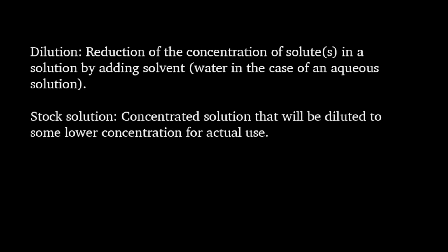Dilution is the reduction of the concentration of solute in a solution by adding solvent. Stock solution is the concentrated solution that will be diluted to some lower concentration for actual use.